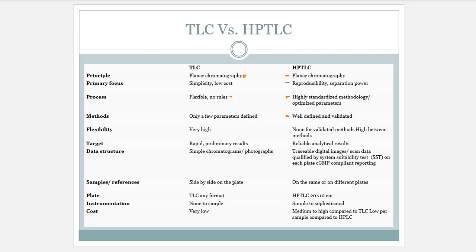Methods are well defined with HPTLC. They have to be if you want them to be reproducible. The methods on the TLC side, if you're doing it by hand, you're limited. You're limited on what you can do with just a simple little TLC plate tank and a lid.